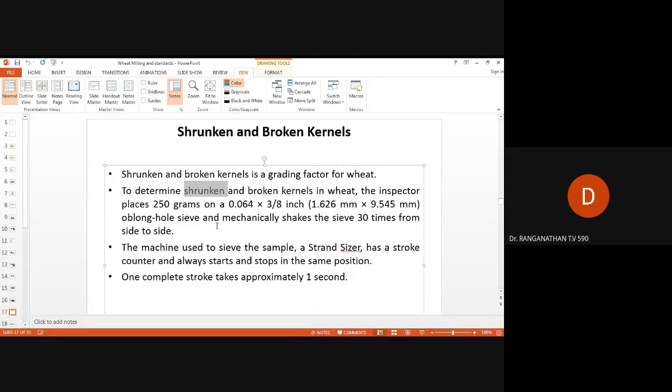Similarly, you also have a sieving machine in the R&D lab, which sieves for varying sieve sizes. Now, what I do, for example, as I already told you, I might take 100 grams or 1 kg of the sample, I pass it through the sieve, and whatever comes out of each of the sieves is collected.